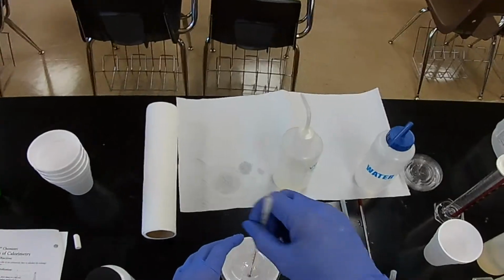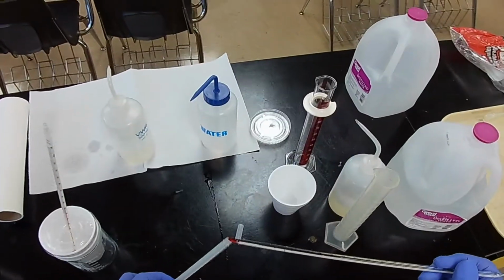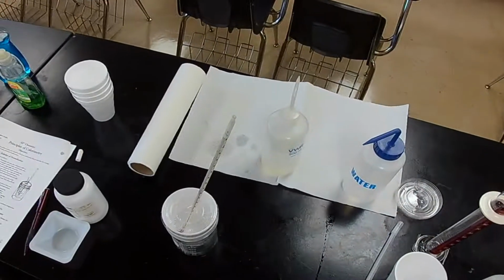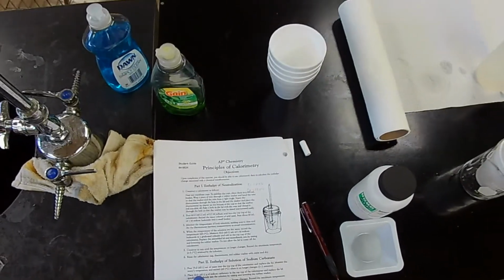Should have marked them. Okay, now we need how much of sodium carbonate? 10 grams. Okay, we need to know exactly how much. It can be less than or greater than 10 grams, but we need to know the exact number.